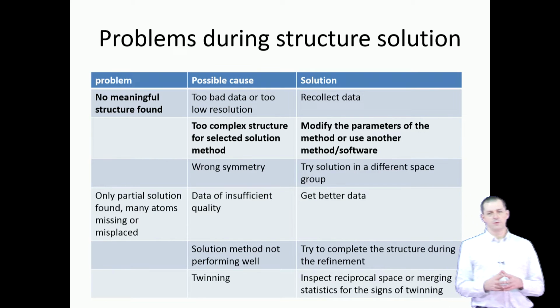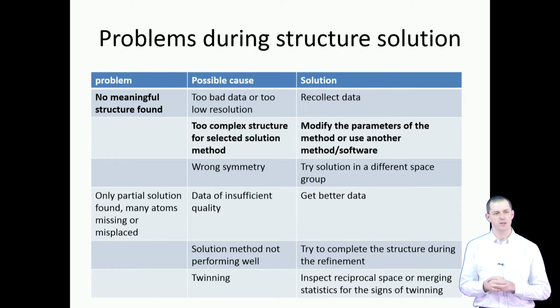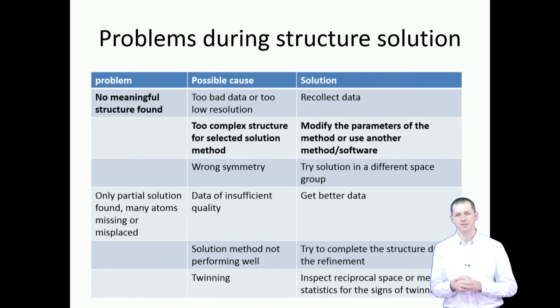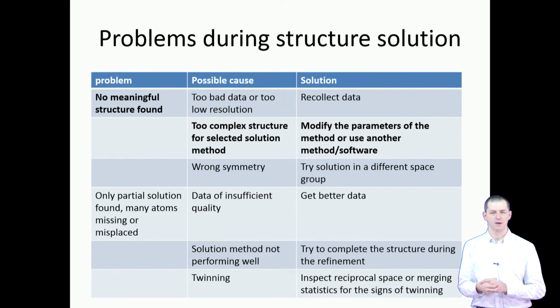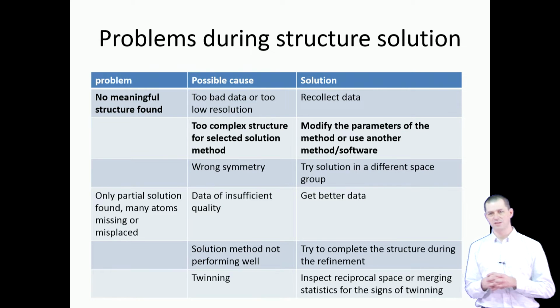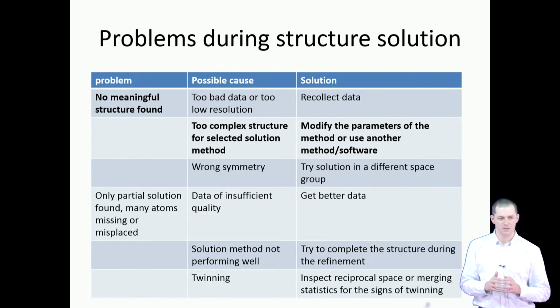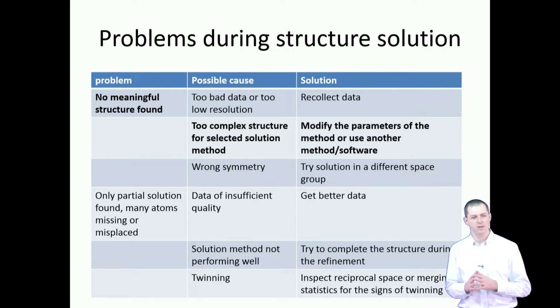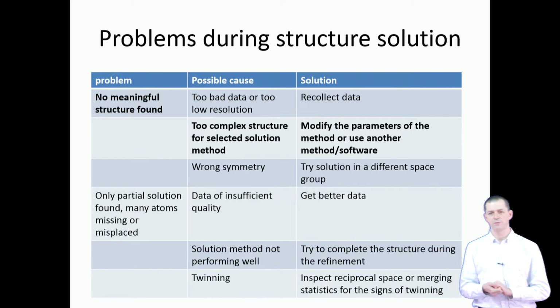Talking about the software available for a structure solution, I'd say nowadays for small molecule and inorganic materials there are three programs in use. It is Shelx-T, which is a successor of Shelx-S that was the standard for 2 decades. So most people used Shelx-S for solving the structure, and Shelx-S was using the direct methods approach. So this is now replaced by Shelx-T program, which is using a dual space algorithm. I do not have time to go into details of these things, but just that you at least hear the keywords. So Shelx-T is using dual space algorithm, and this is now probably the most popular program for solving structures.